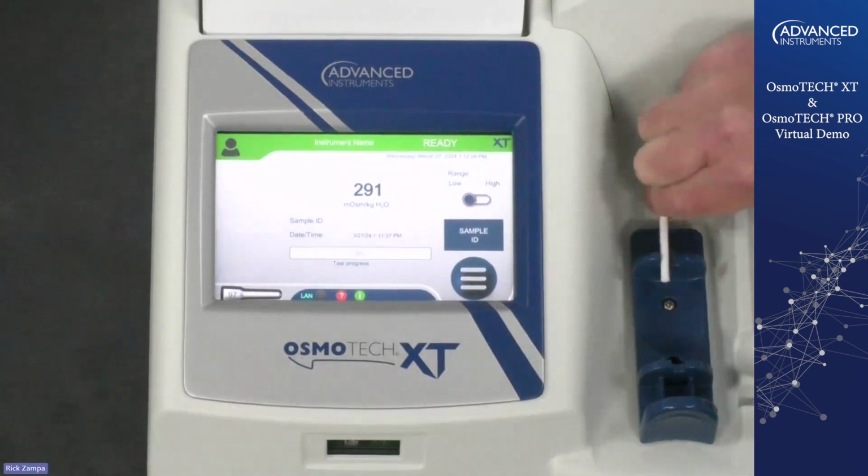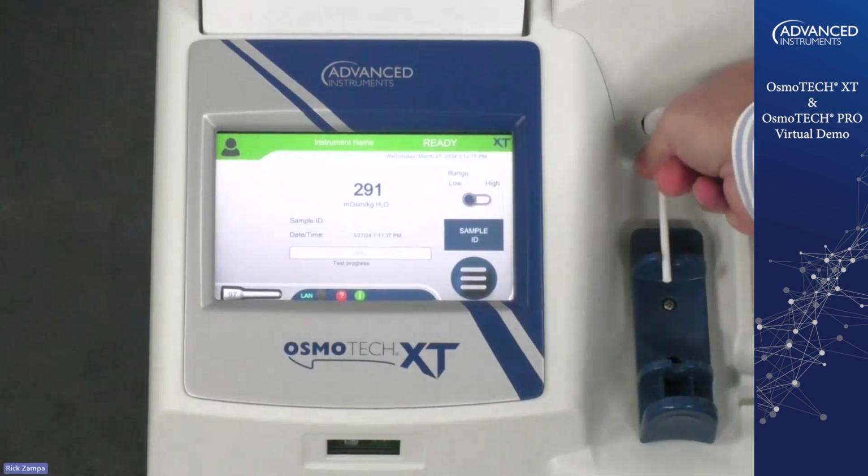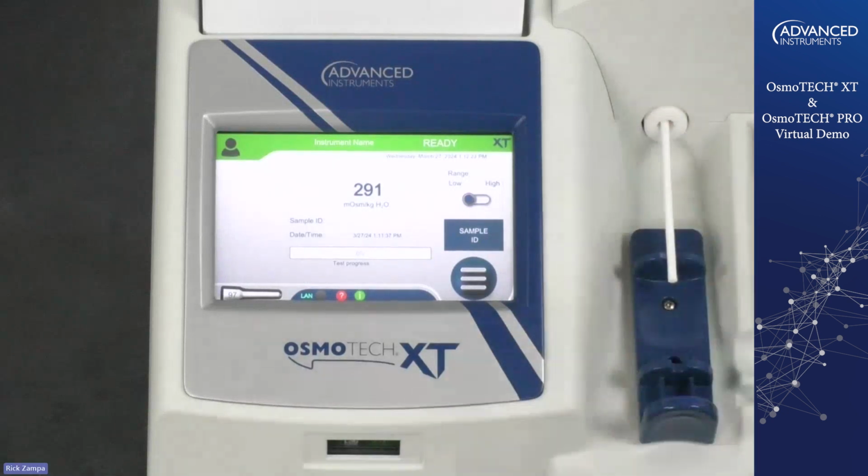I want to make sure it goes all the way to the end and comes to a full stop. And I want to twist it each way a couple of times. I want to remove it, flip it over, insert it again, and do the same thing. And then I want to leave that cleaner in there.